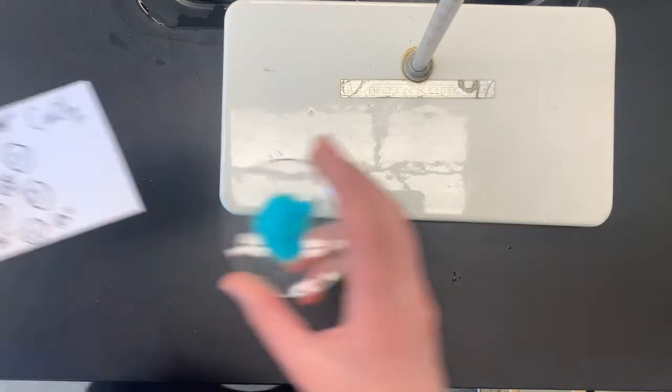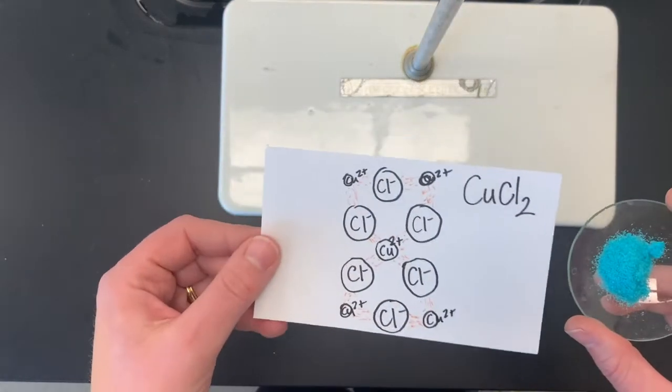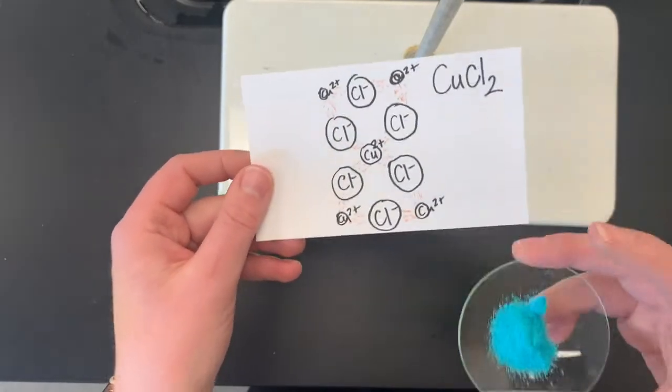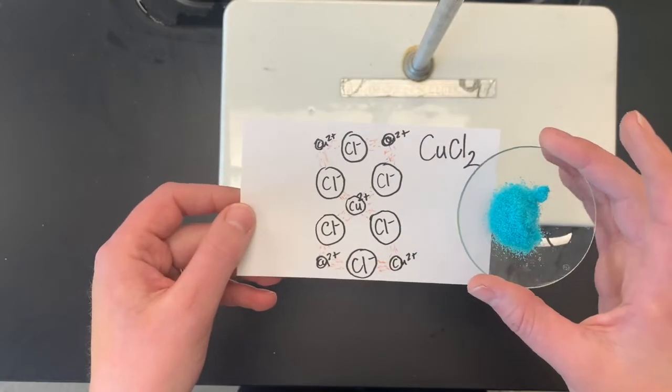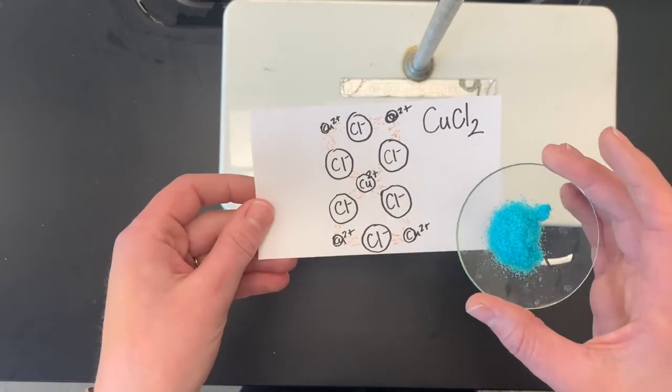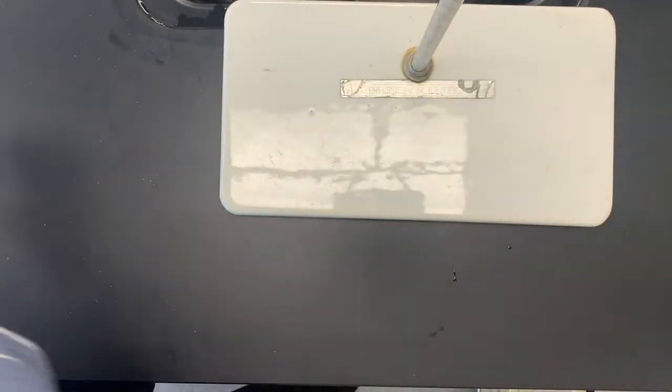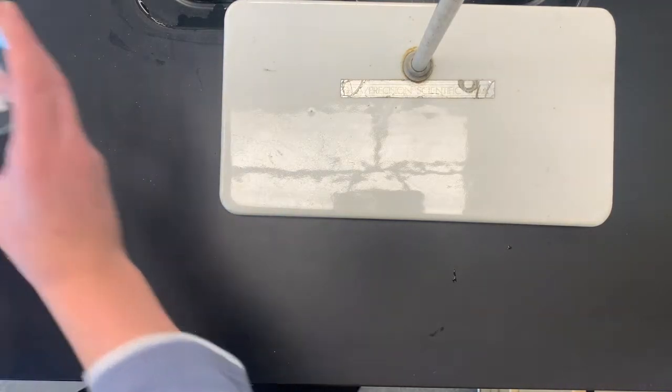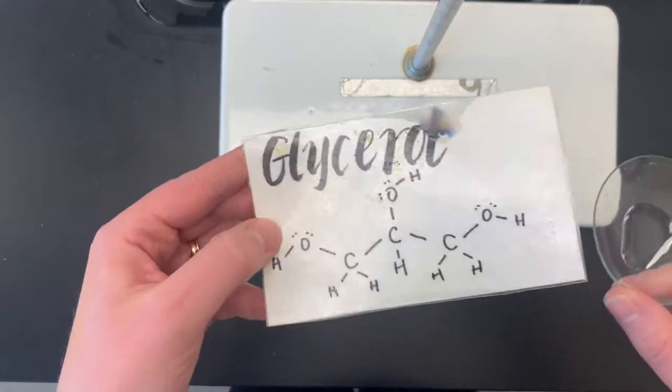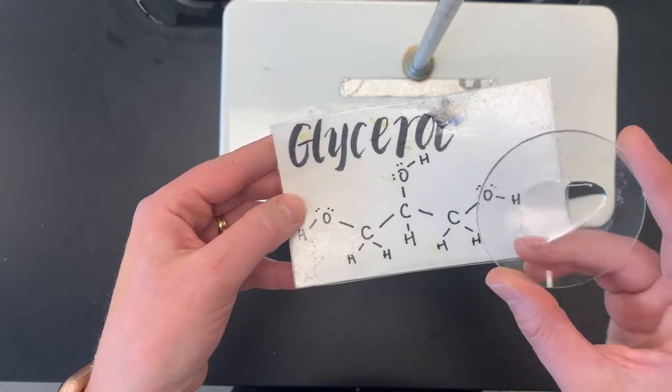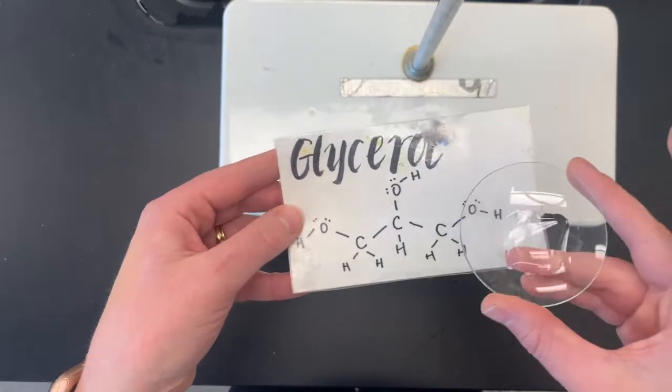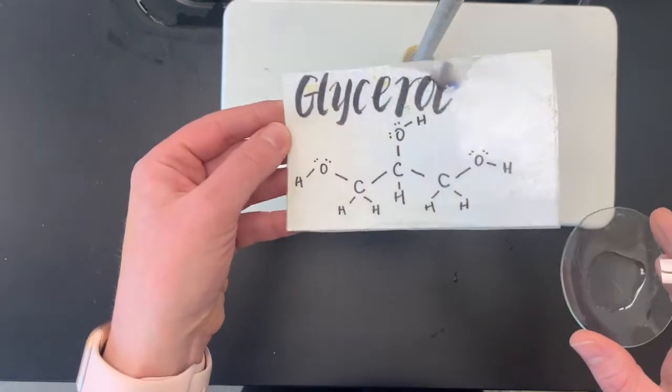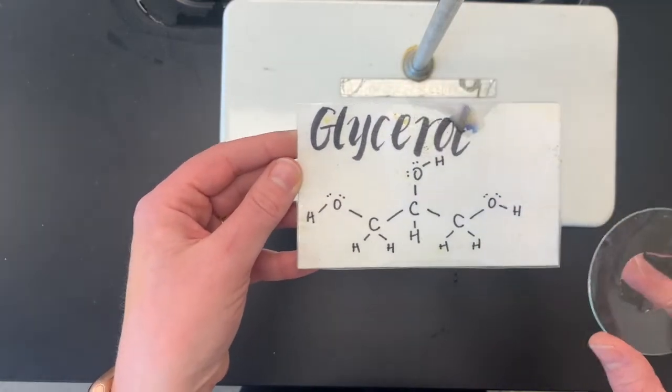Here is one of my favorites. This is copper two chloride. Notice the charges. We have a subscript, they're kind of interesting. Beautiful sky blue color. Then we have something called glycerol. I'll look it up if you want. Again, it moves very slowly. We'll be investigating some of that and how these might move in space. Glycerol right there, so there's one molecule of glycerol. Again, this was also in that same lab that kind of met a hard end, might need to make those over the summer.